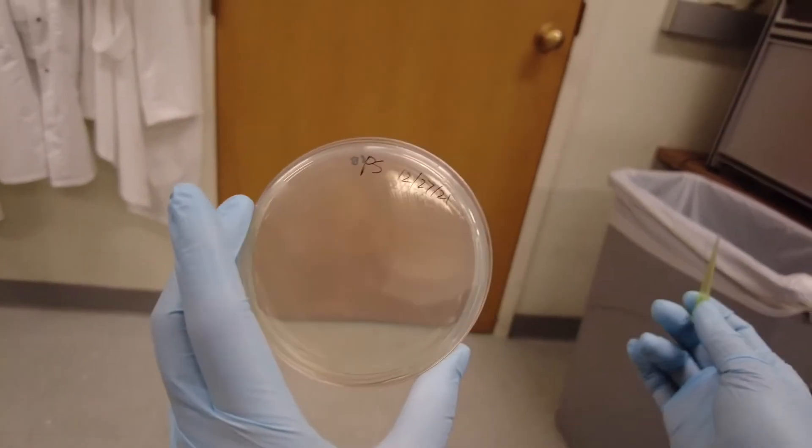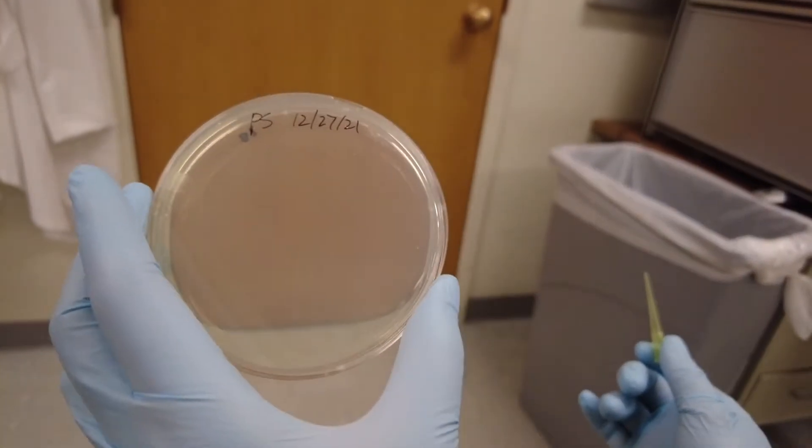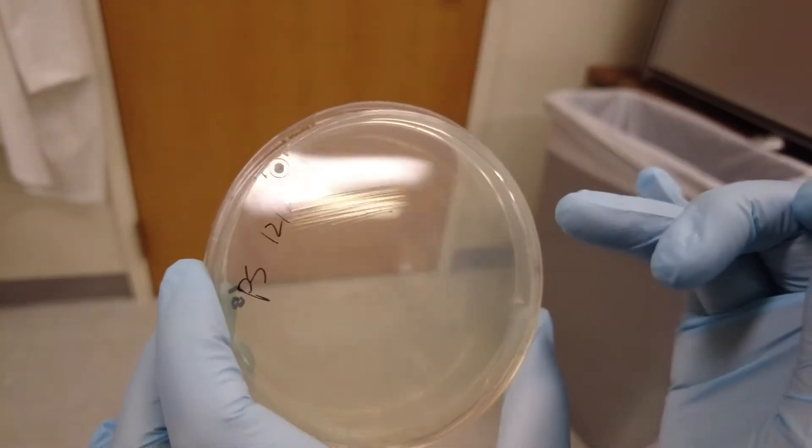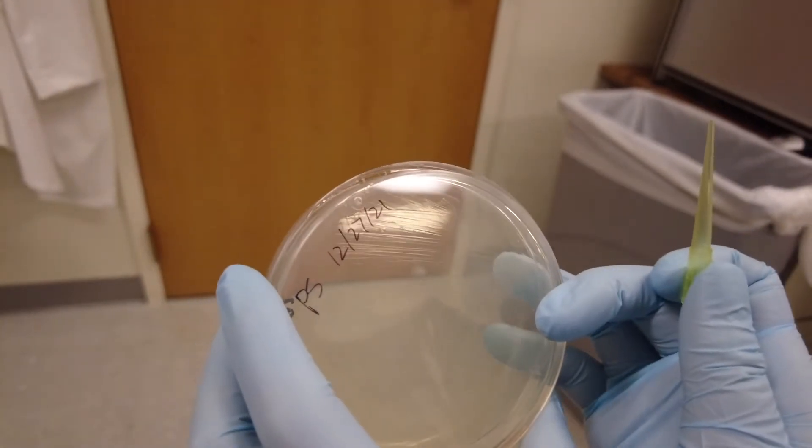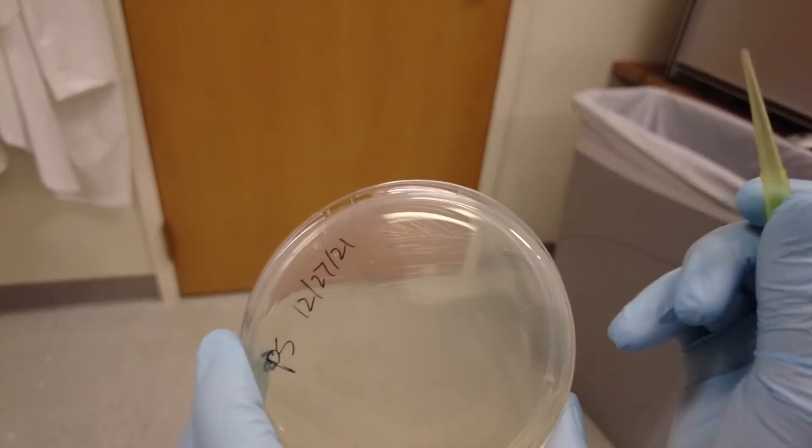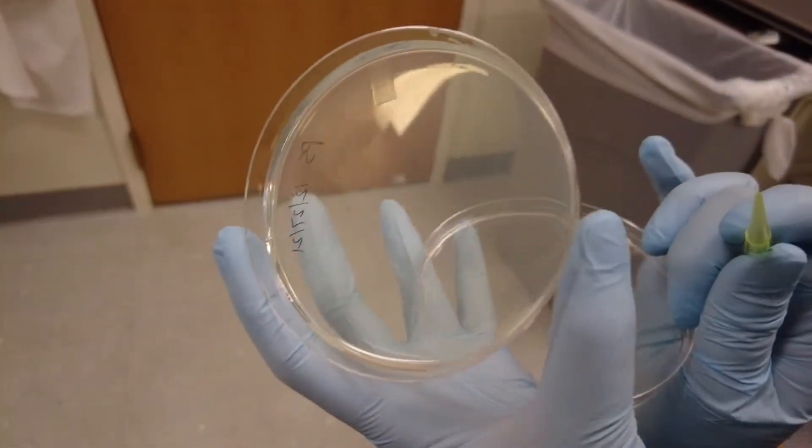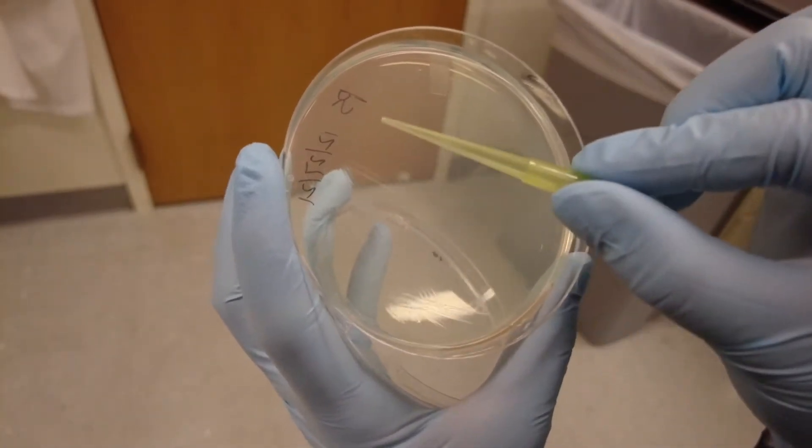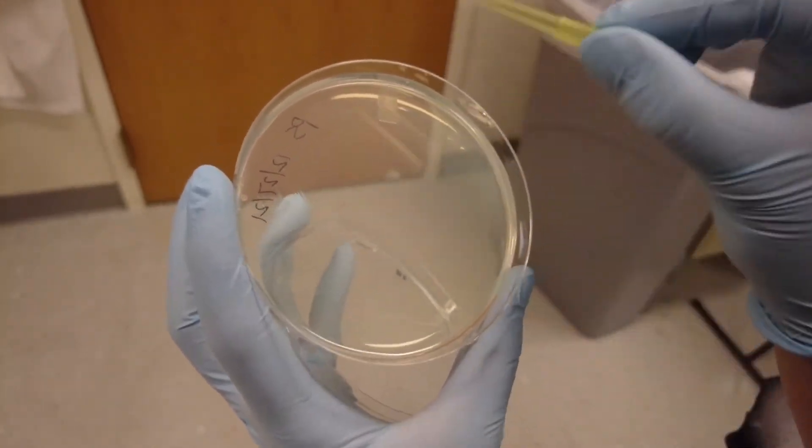Streaking out for single colonies. You generally don't need to do this unless you see contaminants in your things. Just now I streaked out a bunch of bacteria here, so this is where the heavy streaks are. Basically, when you streak out for single colony, you want to use a fresh tip. This tip has never touched any bacteria. You only want to cross path with the heavy streak area once.